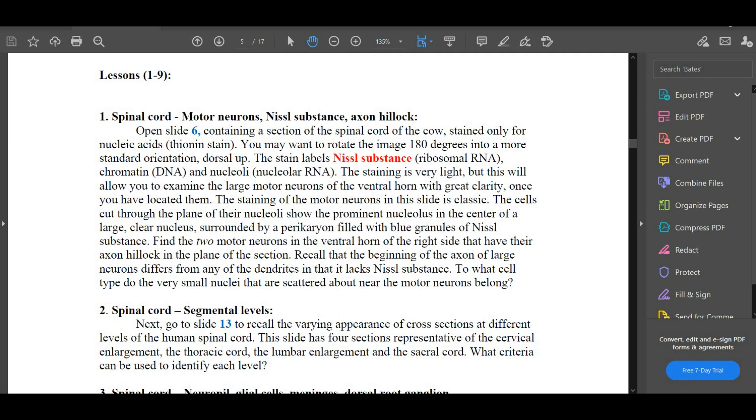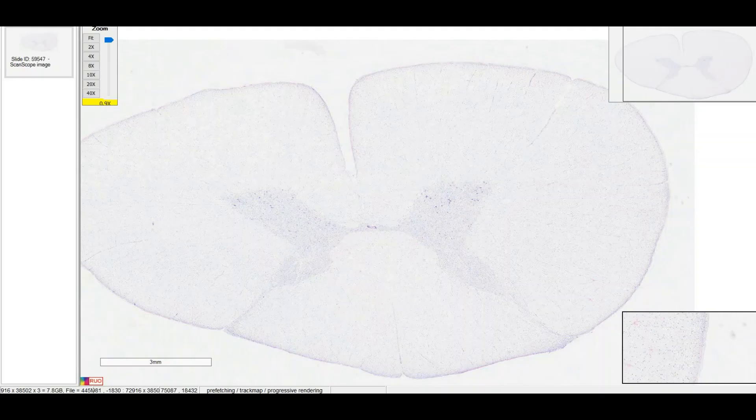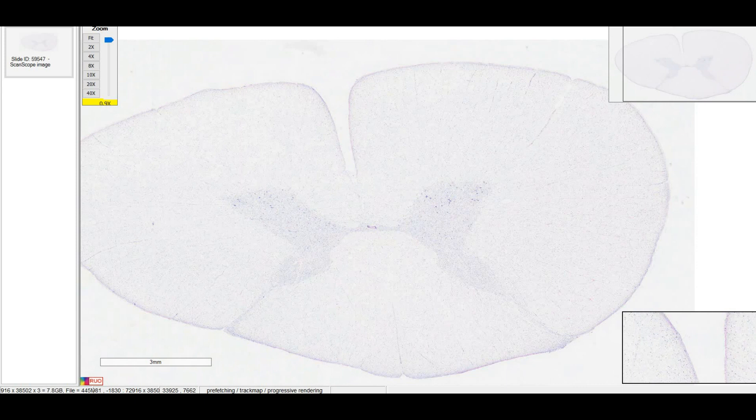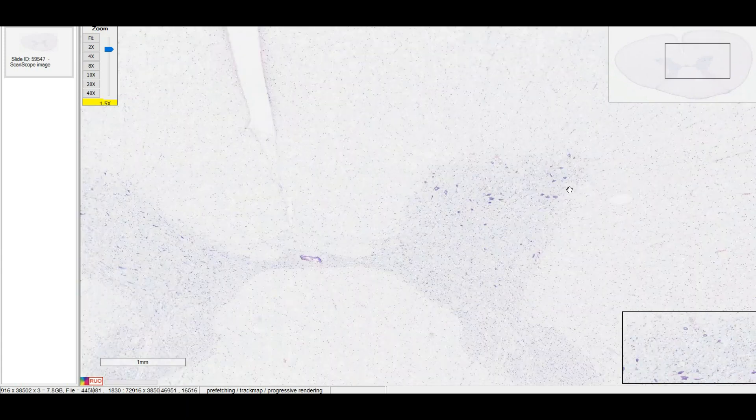First up, we have a cow's spinal cord stained with thionine, which is picked up by nucleic acids. Here's the slide itself. We're going to zoom in over here to the ventral horn. Remember that the orientation here is actually flipped from what we're used to seeing. In this slide, dorsal is down here even though normally we see it at the top.